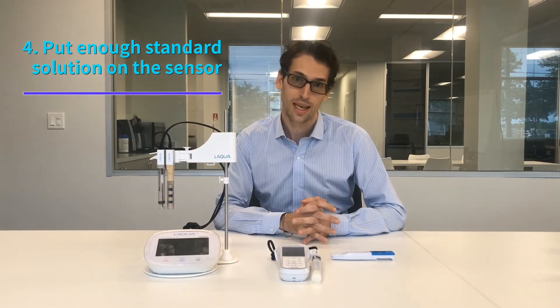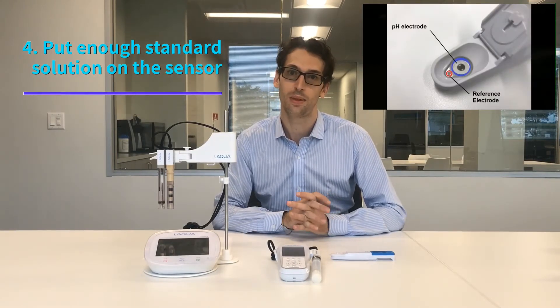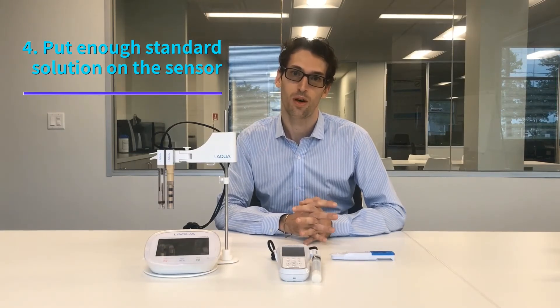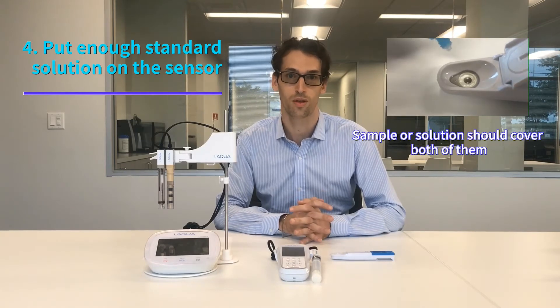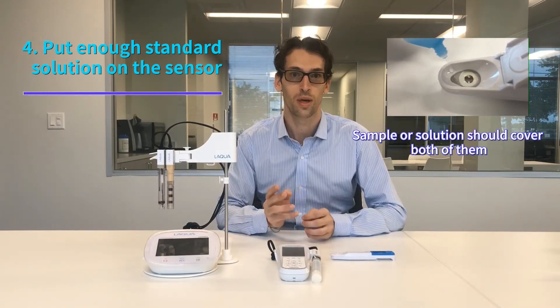The fourth thing you need to know is that on the Laqua Twin pH meter from Oriba it's important to put enough pH standard solution. In the Laqua Twin case the minimum volume is 0.1 milliliter. The electrode is made of two parts — the reference electrode and the pH electrode — and you want to make sure that your sample or standard solution is covering both points, which is very critical for the sensor to read a good signal.